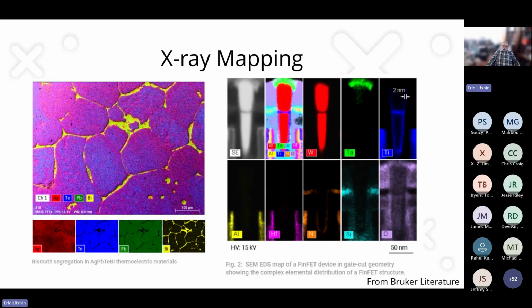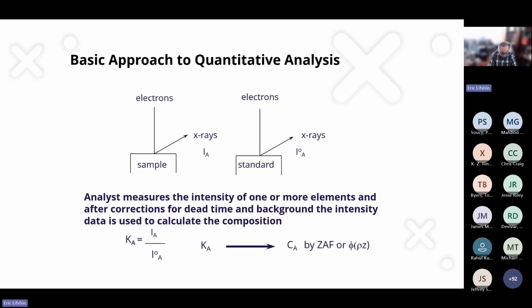Some of those new detectors have pretty high count rates, well over a few 100,000 counts per second. But think about it. If I do a 1,000 by 1,000 image, and it's a 1 second count, I'm only sitting on any given point for a microsecond.